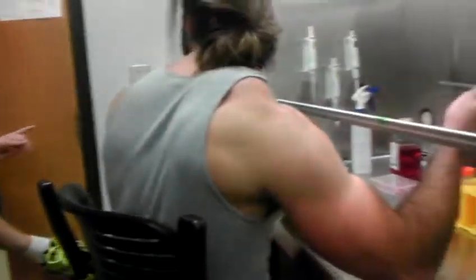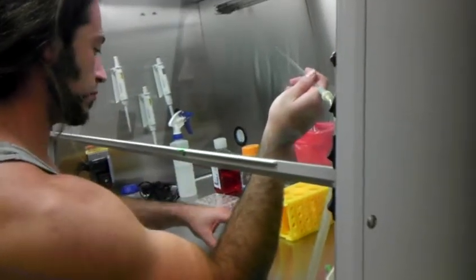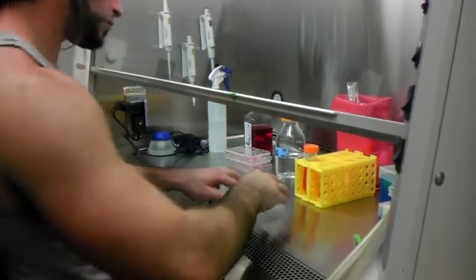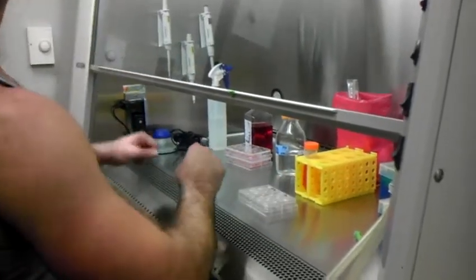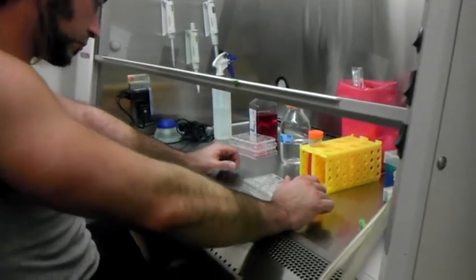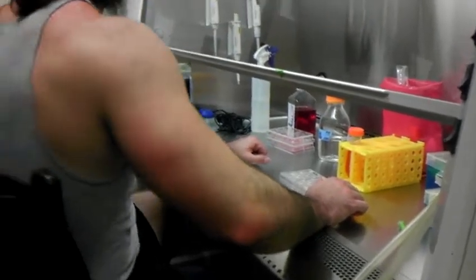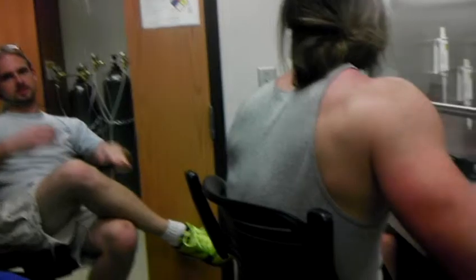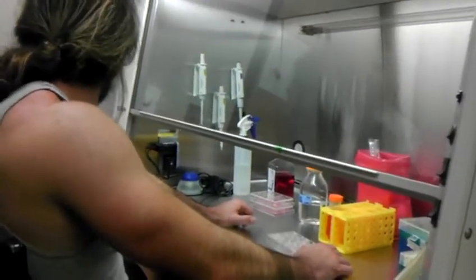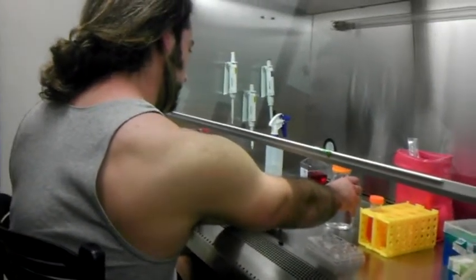Actually, do each plate individually for this section. So let's do one first and then move on? Yeah. The reason it's easiest is that while one person is doing one plate, you can add the plasmid media. Somebody can go shock the cells as you trade off plates, and it goes by a lot quicker. You don't have to wait for the whole thing. You can have a parallel process. So wash all those, go through the process. And I'm going to set up the electroporator. Okay.